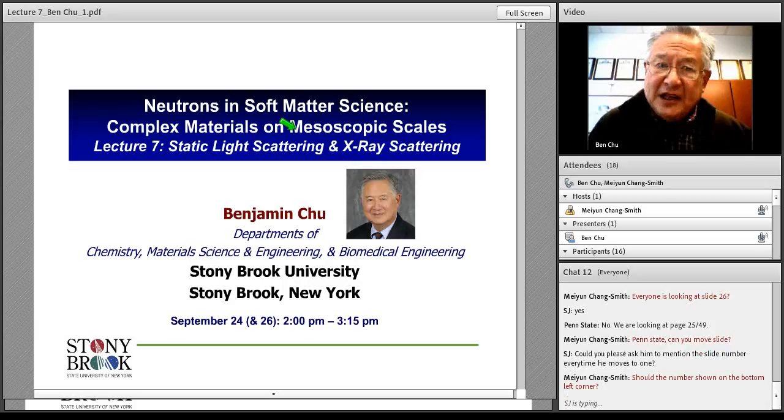And this will change the dn/dc, but of course, if you change the salt, you change the pH, you change other things, and it'll affect the molecules that you are interested in because they are also related to the environment. So even for this simple expression, you can already consider what things are going to affect the measurements that you are going to do.